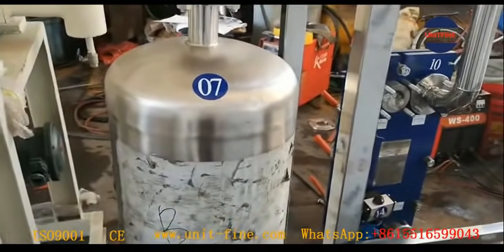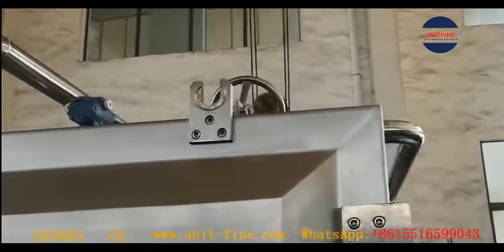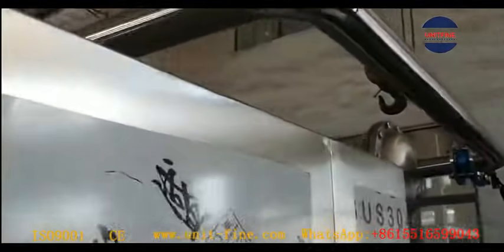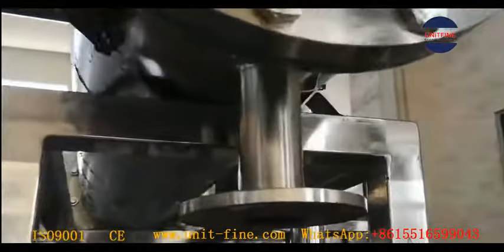For installation, we have labeled every part when doing the trial assembly. The end user could do the installation according to every part label as easy as making a toy.